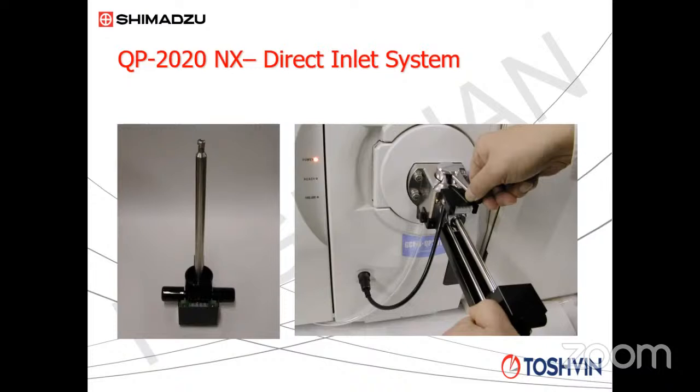So there's a vacuum lock system. You can put the sample into the mass spectrometer and you can complete the analysis in hardly about 5 to 6 minutes. So what you see on the left-hand side is the probe. It's not a very big probe. This probe I can put in my pocket also. It's a very small one. And there is a very small quartz cup where you have to put a small grain of the sample. If it's a solid sample, just a few grains of the sample are required. If it's a liquid sample, you require hardly 1 microliter of the sample.